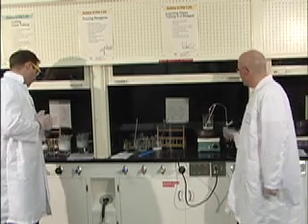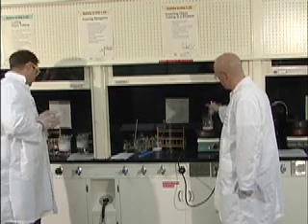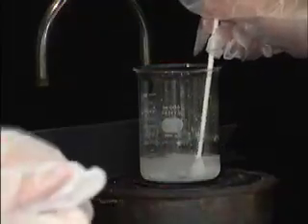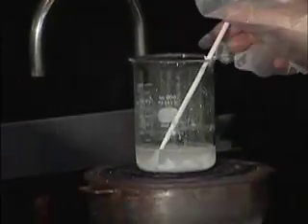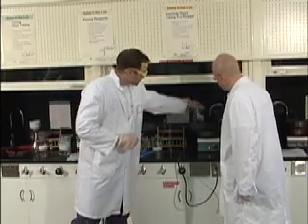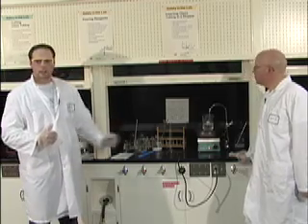All right. Then we cook this for how long? You cook that until it all dissolves. Once it's all dissolved, we're going to add our 200 mils of warm water into the solution, and it should end up looking something like this. So if we take that off, I'll move this one off. We're going to end up with something on the steam bath that looks exactly like that.